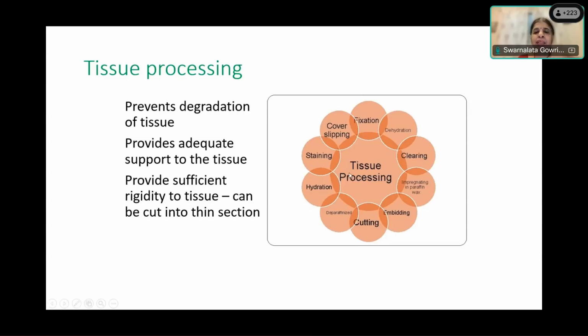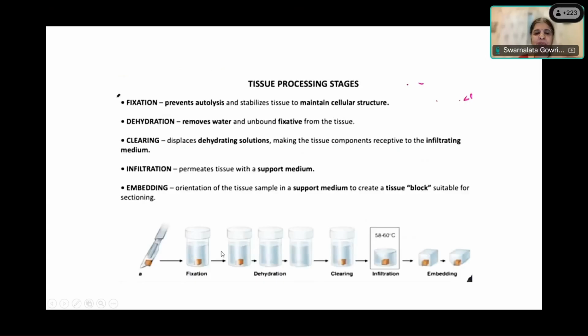Okay, so we have fixed the tissue, now we have to process it. We first need to dehydrate, which means remove the water, and we use graded alcohol for this, usually isopropyl alcohol. If you use ethyl, it's very good, but ethyl, as you all know, can be misused. So we don't have ethyl alcohol so easily available in our laboratory. Having dehydrated it, we remove the fat in it to clear the extracellular spaces. So we use xylene, or you can use something like toluene or other things.